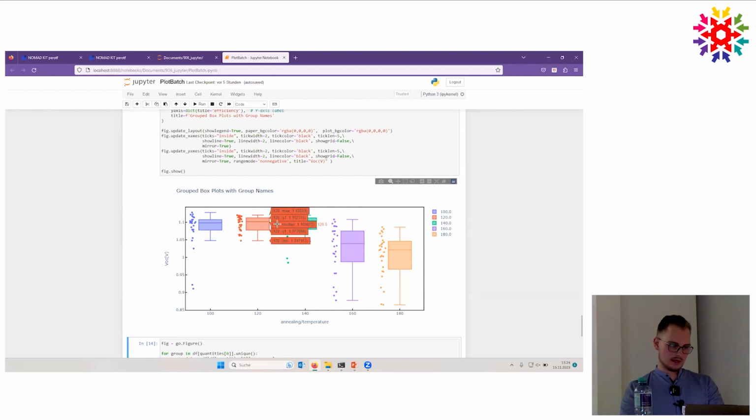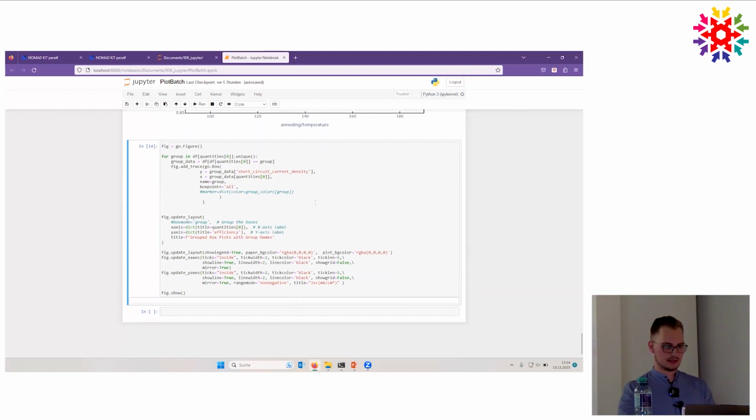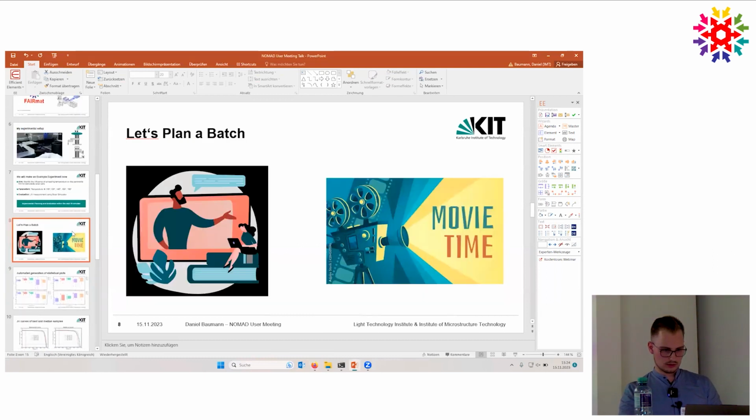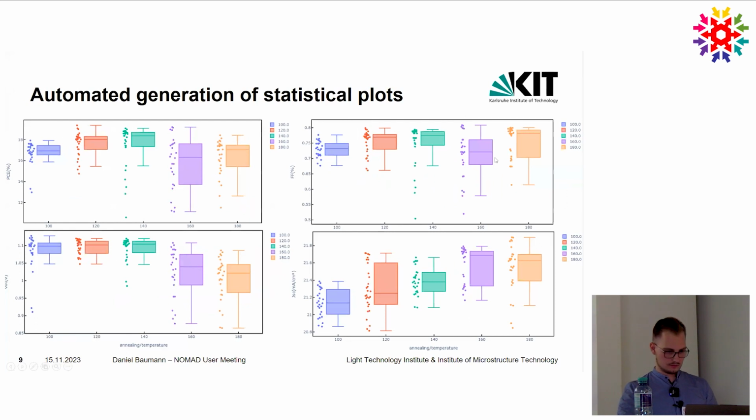Okay. And there are many more kinds of analysis you could make, but this was already the main part for the live demonstration. I can go here into the presenter mode again. Okay, yeah, in case this didn't work, I have also here the data backed up.